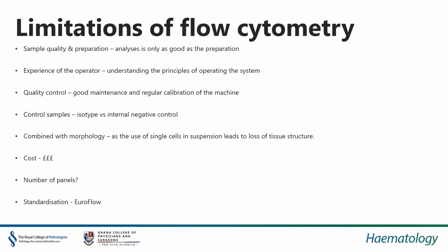It must always be used and combined with morphology, because the use of single cells in a suspension, like I said, does lead to loss of tissue structure. And it can be quite costly. These monoclonal antibodies that we buy from commercial companies can be quite expensive. And you can end up producing a number of panels to diagnose these patients.